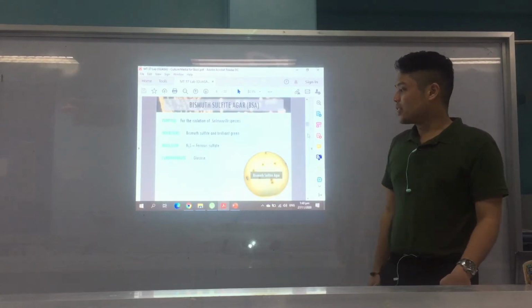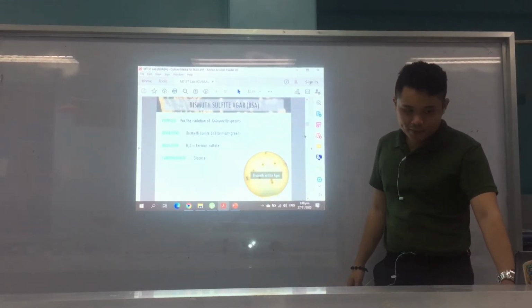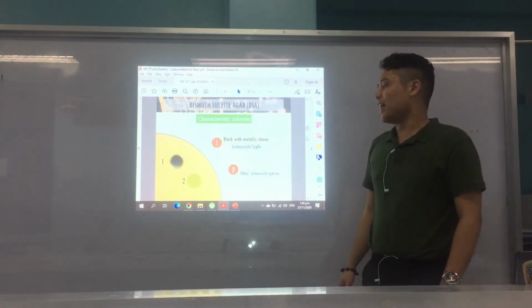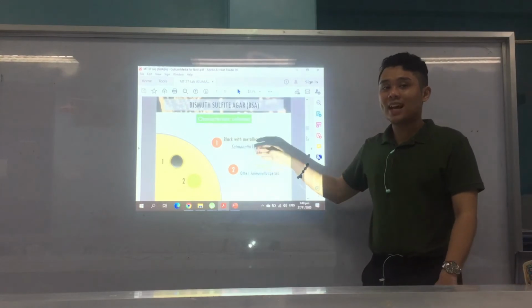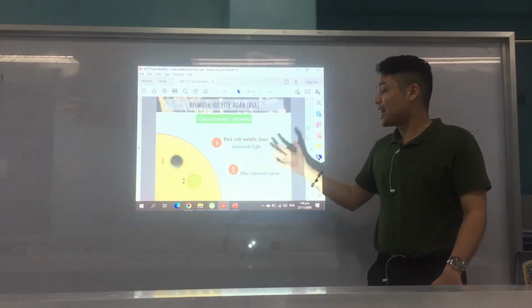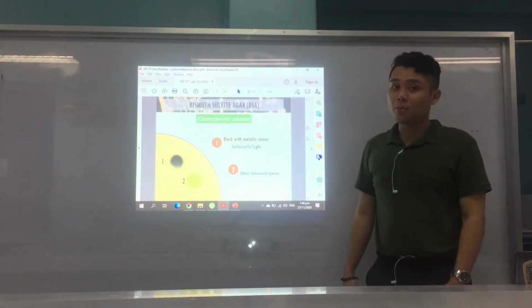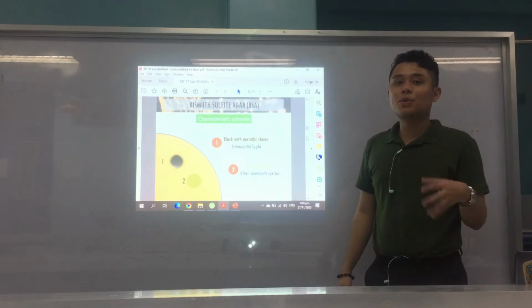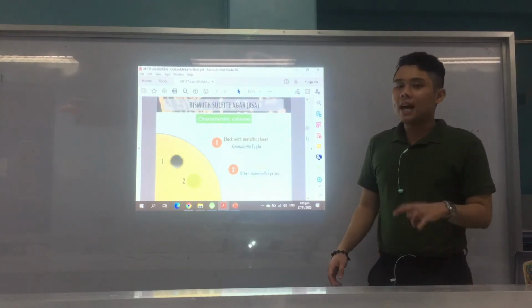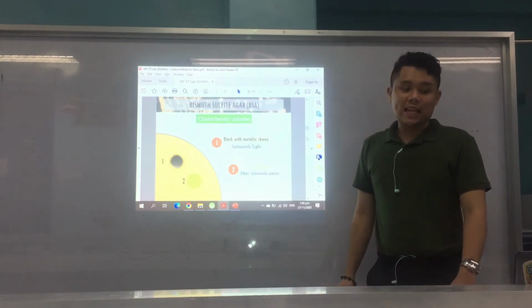And this is your bismuth sulfite agar or BSA. If black with metallic sheen, that's specifically Salmonella typhi. And black with light green, without the metallic sheen, that's other Salmonella species. Because some of the other Salmonella species, if I'm not mistaken, do not produce H2S, or produce very little. But black with metallic sheen is characteristic of Salmonella typhi.